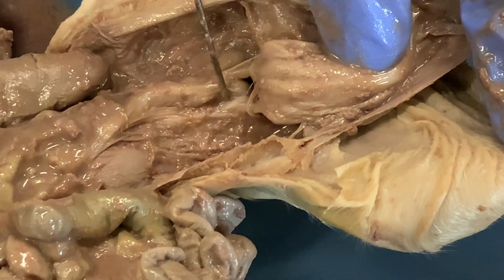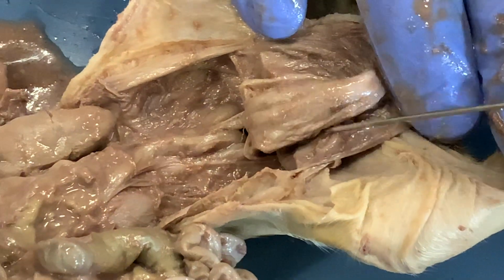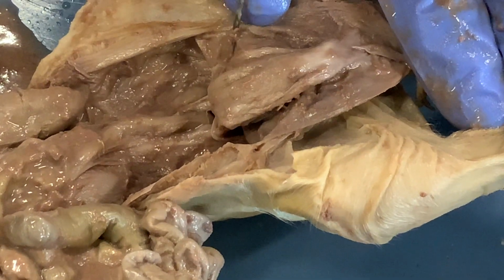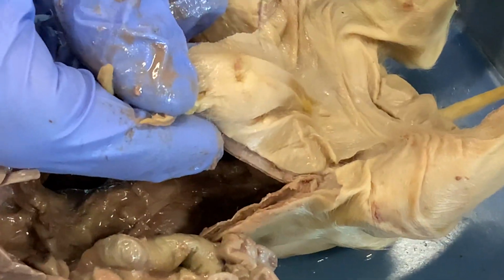to the other kidney, and then they connect here to this bag on the back of the umbilical cord and reproductive organs there, which is the urinary bladder, and then that connects up here to the urogenital opening.